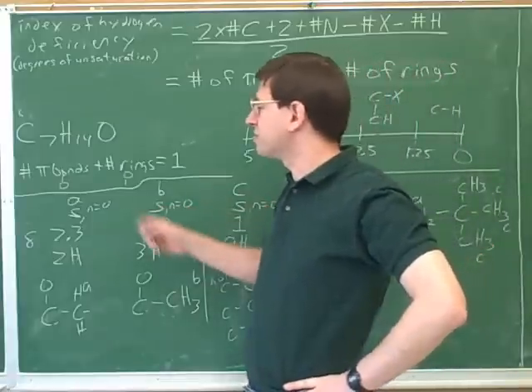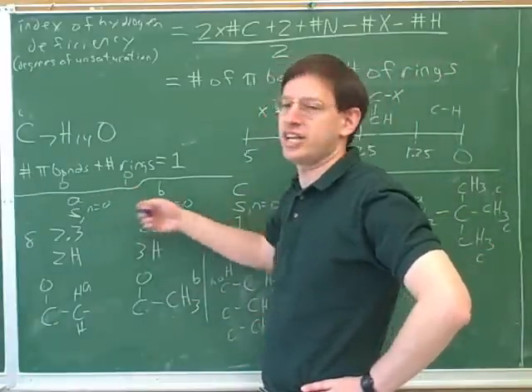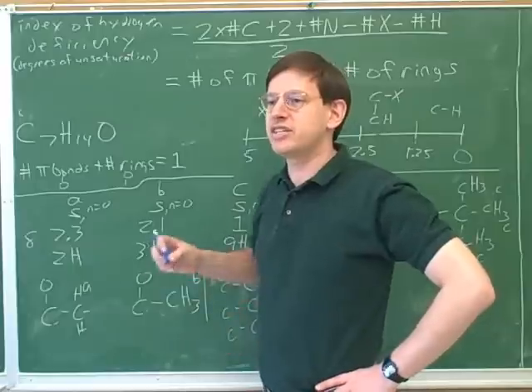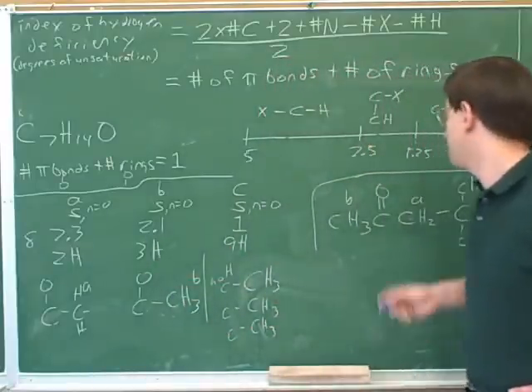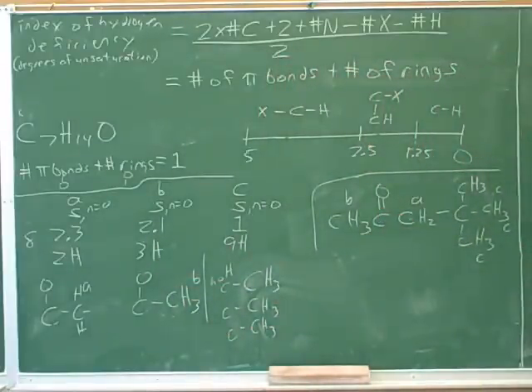So the fact that these were all singlets was a very strong clue. There's not that many structures where none of the hydrogens are adjacent to any other hydrogens. If you're not adjacent to any other hydrogens, you must be connected to a carbon that's got no hydrogens on it. So there's not that many ways that we can put that structure together.